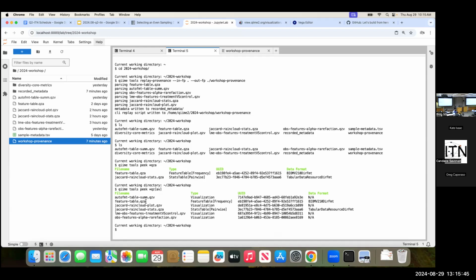As a user, you don't really need to concern yourself with these. If you ever had a question related to this, where you're trying to piece this together, that's the kind of thing we're more than happy to help with on the QIIME2 forum. But I think you had another question.